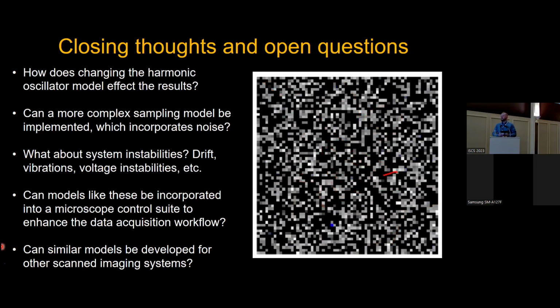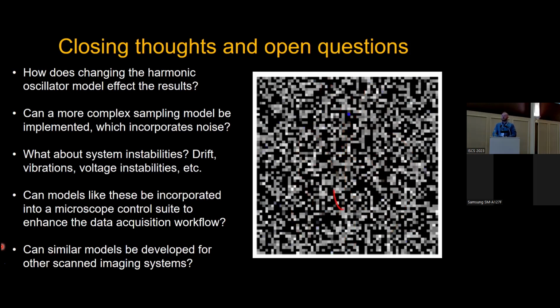The only problem is the manufacturers are really black box about this. They really don't like you prodding and poking because unfortunately you'll unravel the web that they have spun to get images that look good. We know that they're doing things behind the scenes that they don't tell us about, because obviously they want the edge on the competition. It's just a question of can we disable all of that stuff, get the real data, get as much info as possible. And so we're excited about how that's going to go if we can get the manufacturers on board, which it looks like we'll be able to. So, thank you.